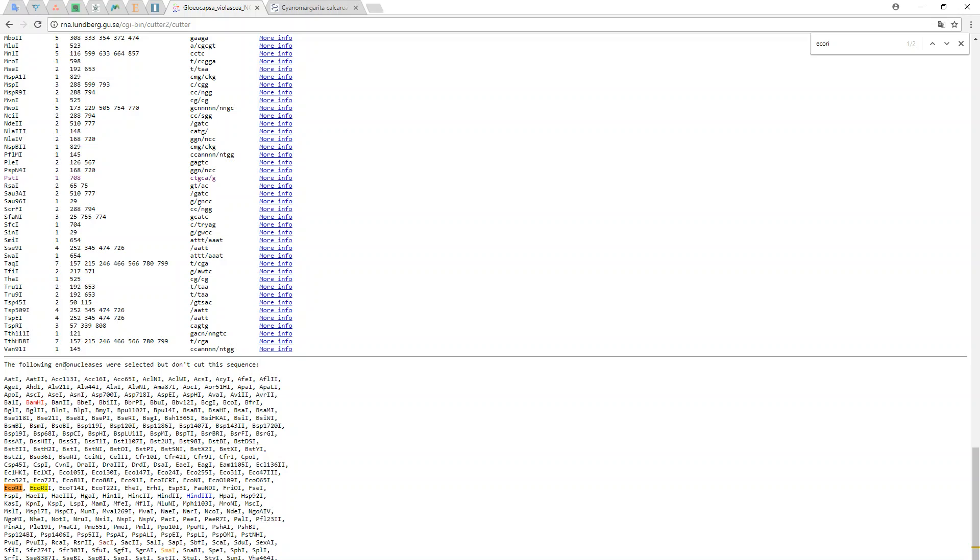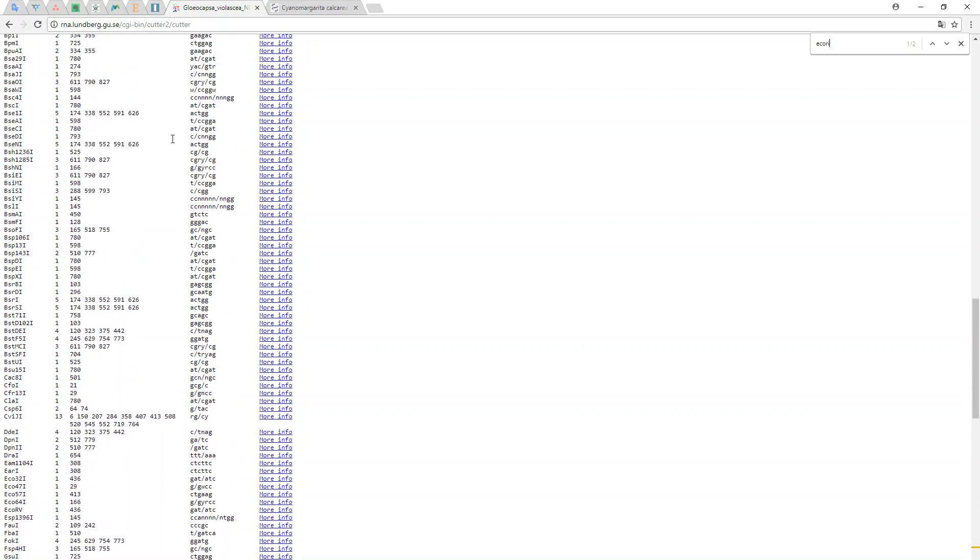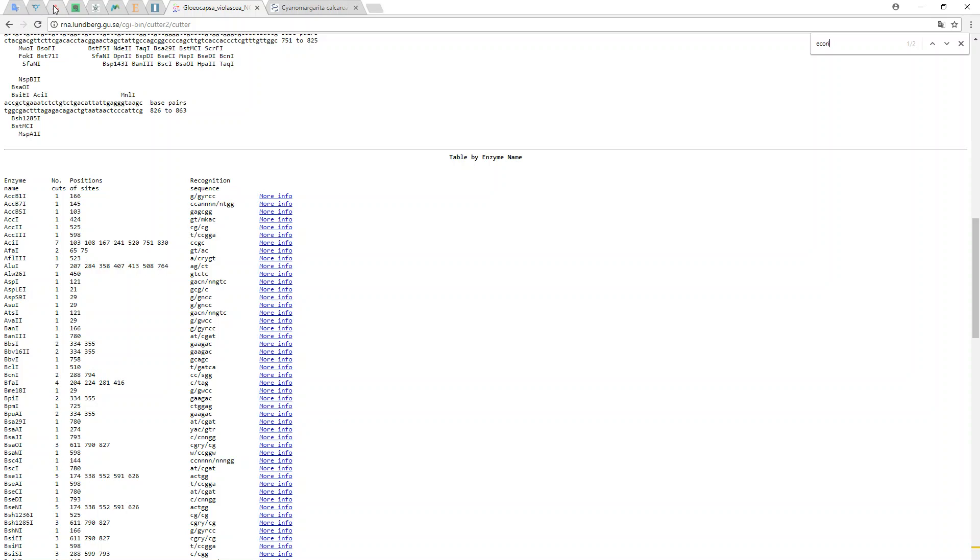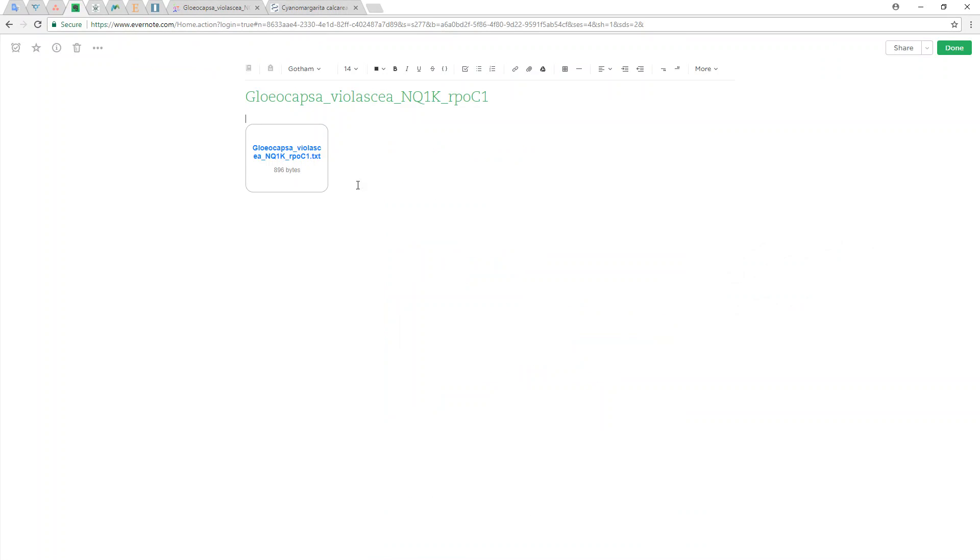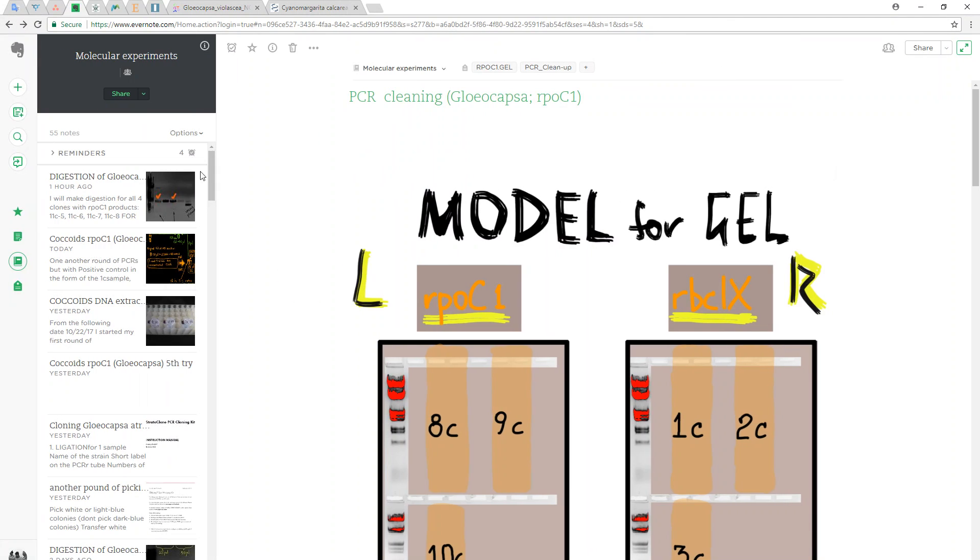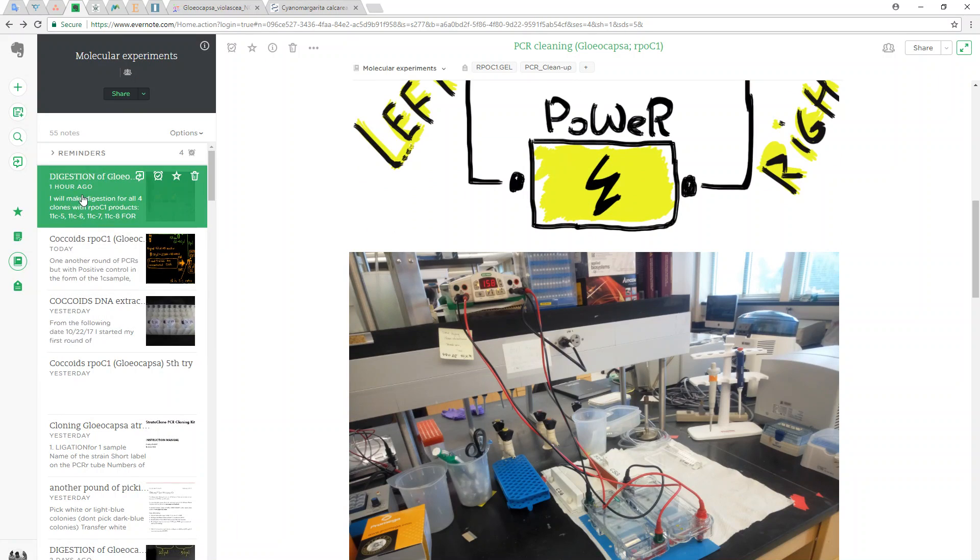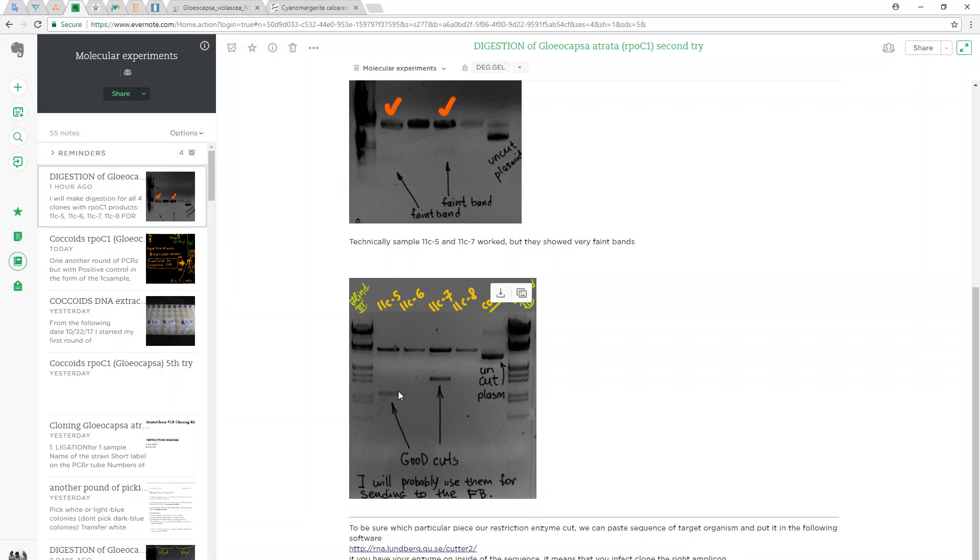The message says that EcoRI is not in the genome. What does it mean? Even if we cut the right piece on the gel as we can see here, we really don't know what that is, because the restriction enzyme cut pieces on the plasmid which were in the E.coli genome, not inside the RPOC1.